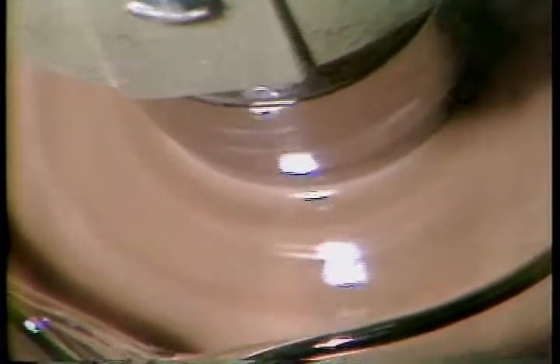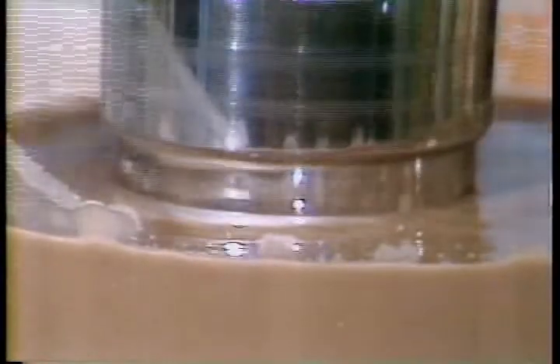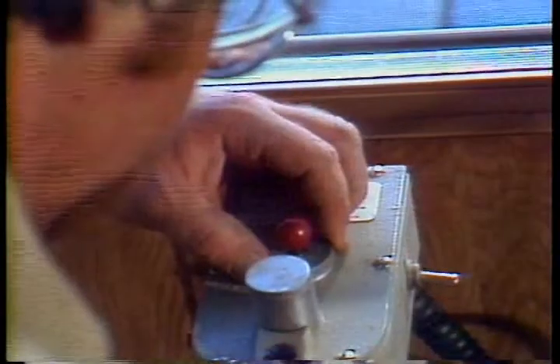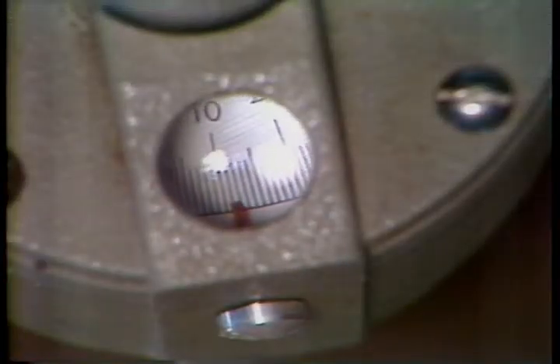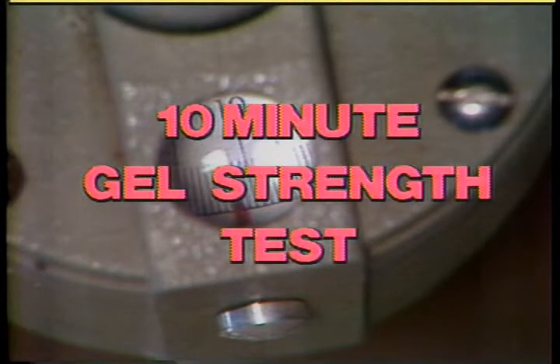Now he'll stir the mud at 600 RPM again for 10 to 15 seconds. Then he'll let it stand for 10 minutes. Then he'll take another 3 RPM reading. Again, when the needle drops back to a lower number, the gel strength has broken. This is called the 10-minute gel strength test.